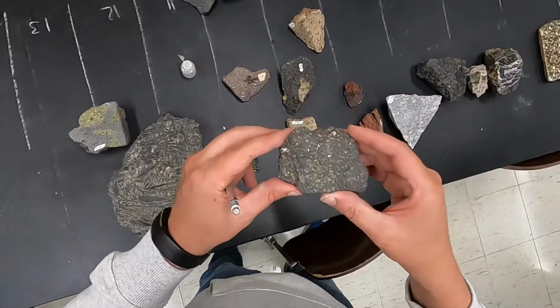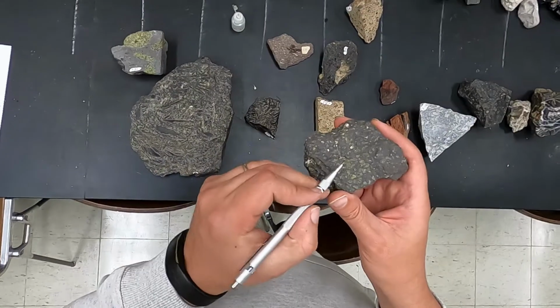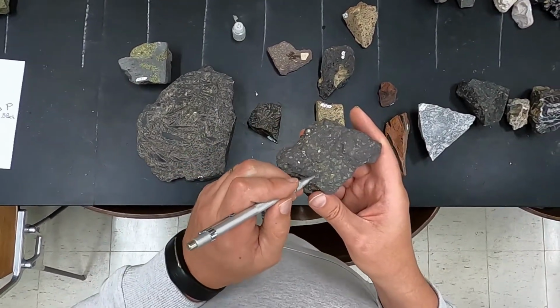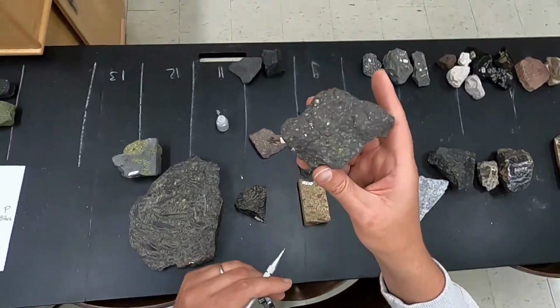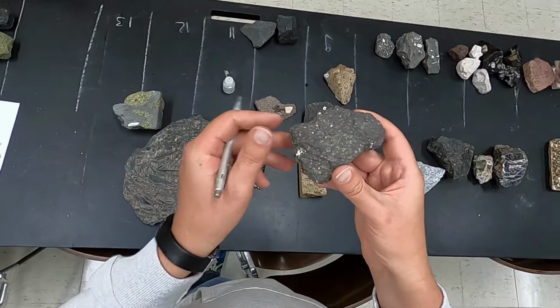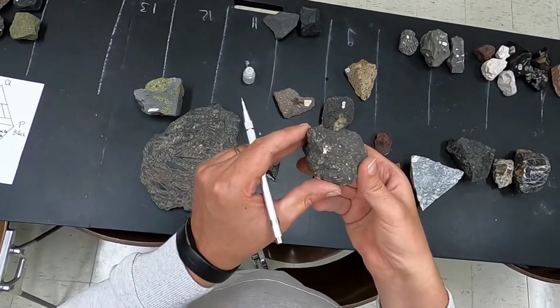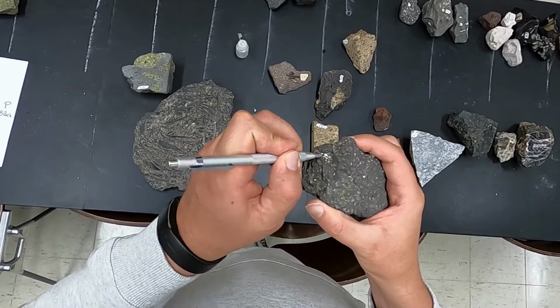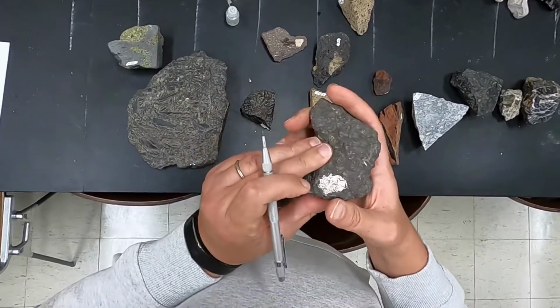Here I have another example of vesicles. These are much more greenish in color. So in this particular case, I would definitely interpret the vesicles as representing epidote in composition. So they likely have epidote, and I can definitely see much more clays in here as well.